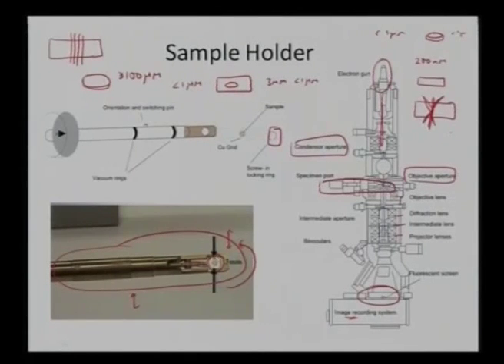So, what I eventually get is more like this, a material with a very fine hole in the center. This particular point is nothing but a hole, and the area nearby this hole is now transparent to electrons. Ideally if I see it, it will be more like this, transparent to electrons. This is what I am really targeting, to get a material which is transparent to electrons.